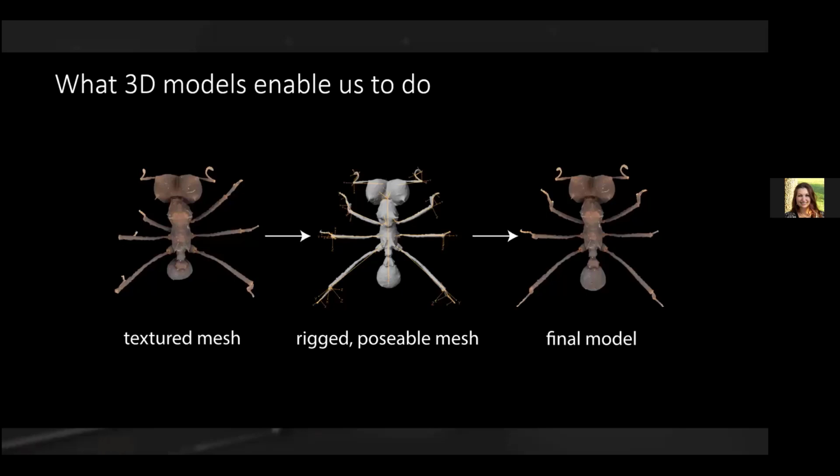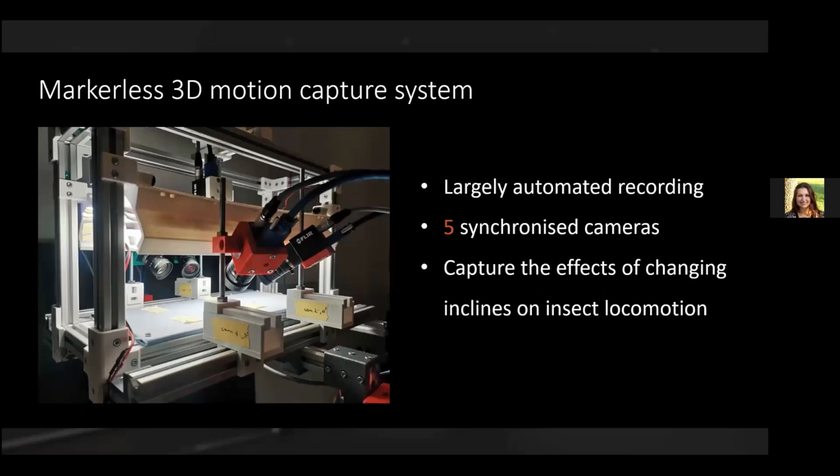Now, one way to bring life into this is to use so-called markerless 3D motion capture. And we have built a system for that in our laboratory. This one was built by Hendrik Beck.